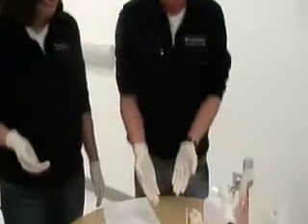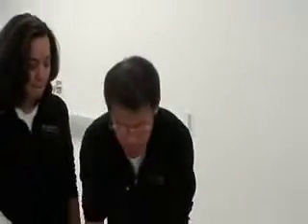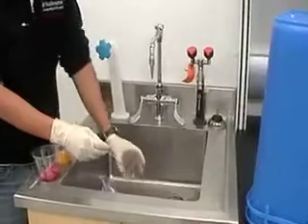Now that you've completed the experiment, be sure to remember to clean up after yourself. And everything that we've worked with here, you can just basically just dump down the drain. And whatever is left over, you can just go in the trash can.